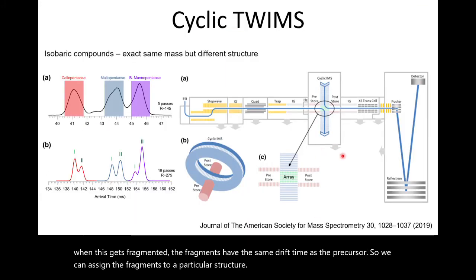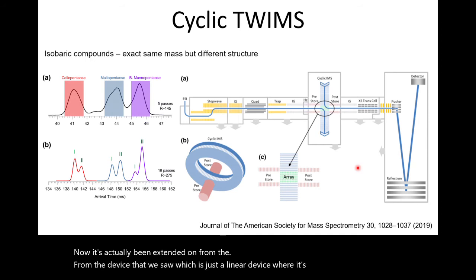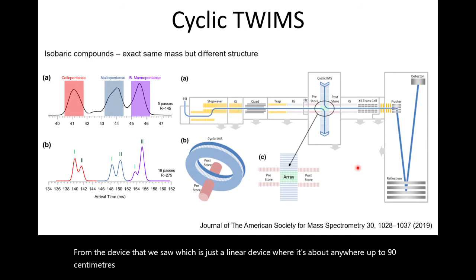Now, it's actually been extended from the device that we saw, which is just a linear device where it's anywhere up to 90 centimeters long. Typically, they're about 25, 30 centimeters long. And you have them in the instrument and you just drift the molecules through there.